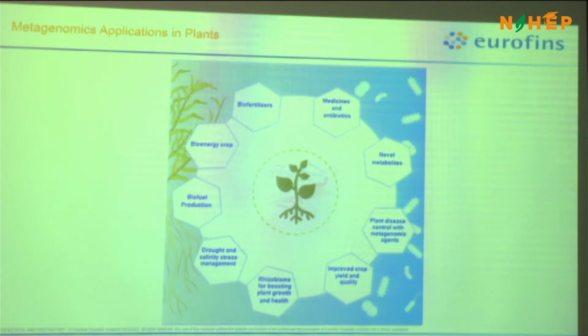We do a whole metagenome of the entire plant and remove the plant part of it. For example, we are doing a virome analysis on a rice sample. We sequence the rice leaf sample if there is an infection in the leaf. We remove the rice part of it because we already have an existing database, an existing genome, for rice.